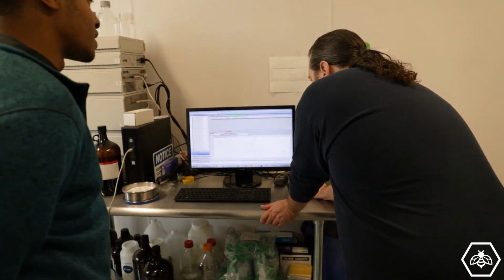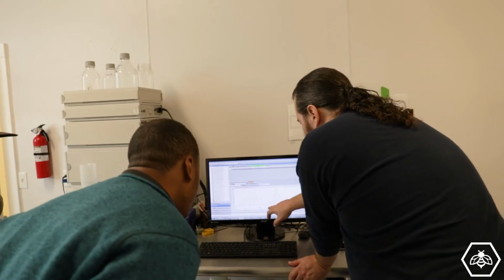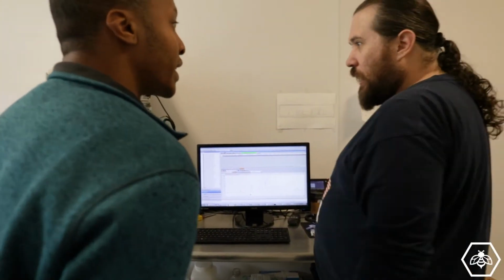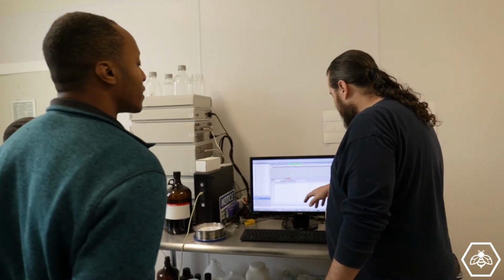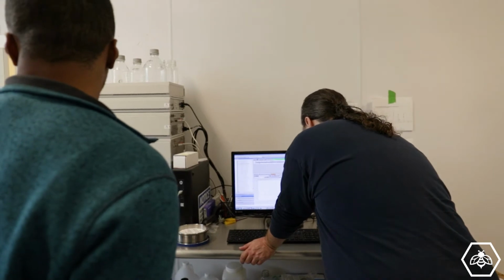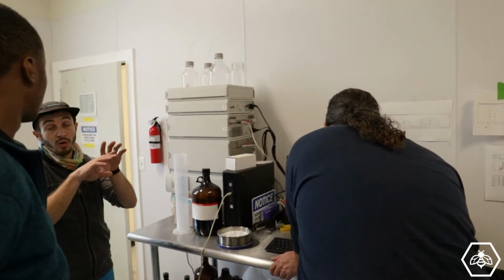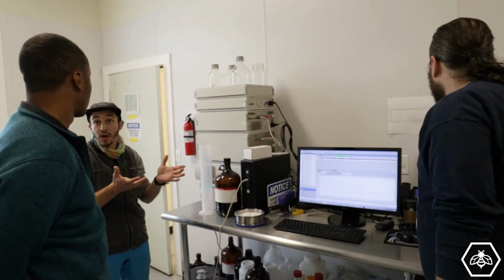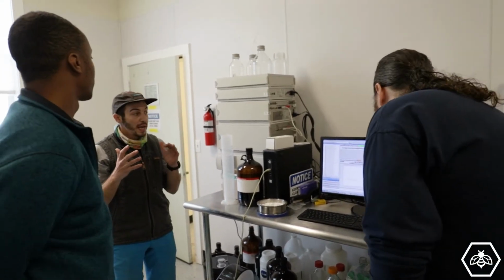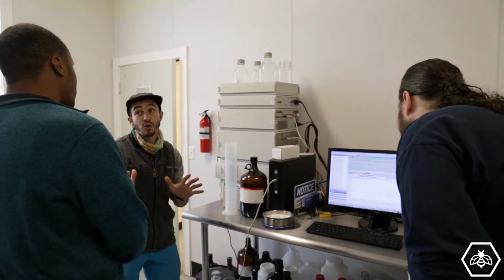So you've got these other 2 humps here. I think one of these is like XO THC, and there's other XO THC, and they're just other isomers of THC. These 2 peaks are overlapping. You can even see here that they're overlapping in most chromatograms. In order to get them to not do that, you have to change the method, and it just takes more time. Most haven't changed their methods. They're using old methodology. No, it's just a different method.